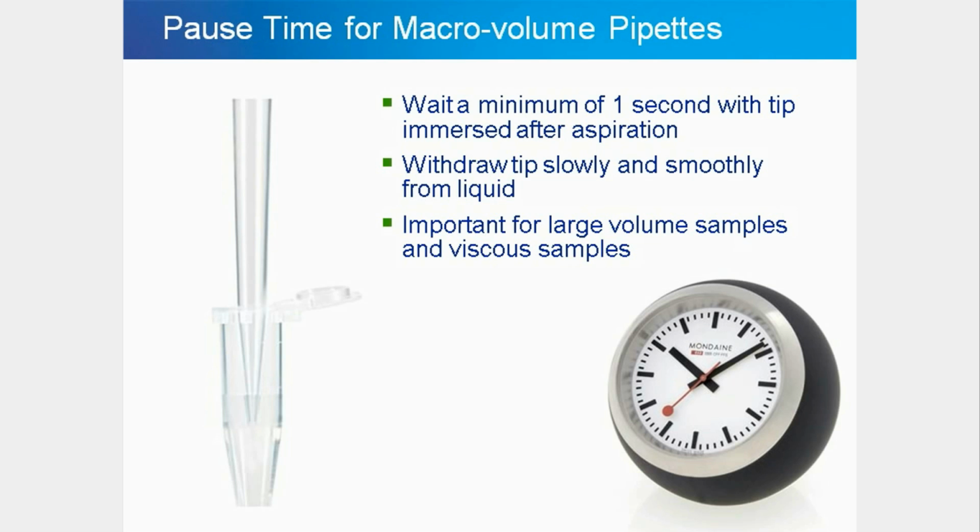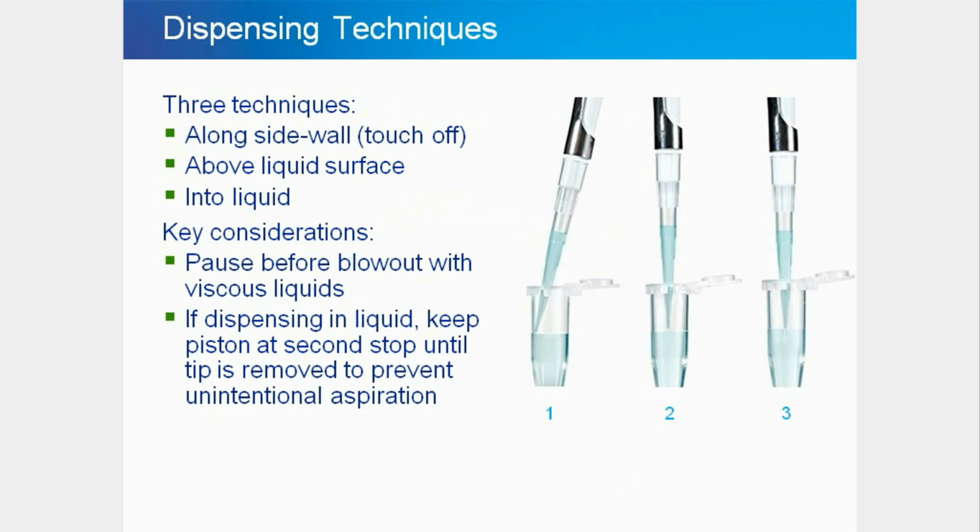Each of these factors will affect the accuracy of the sample delivered. Another factor is, even after you have done everything properly, the pipette is being moved about after aspiration and an air gap appears. This is just settling of the air interface, which acts like a spring and will not affect the accuracy of the sample.